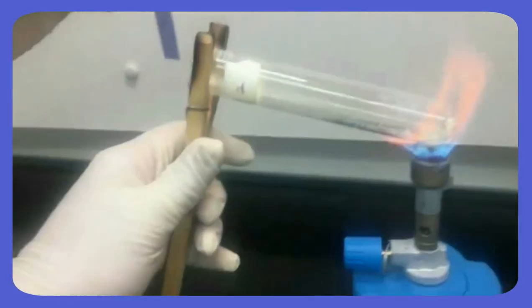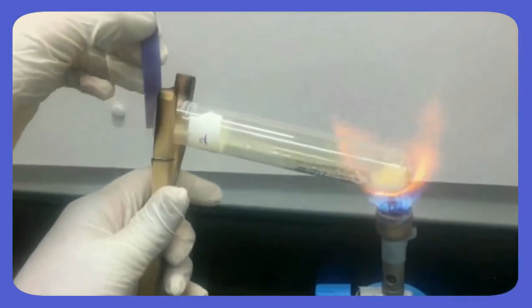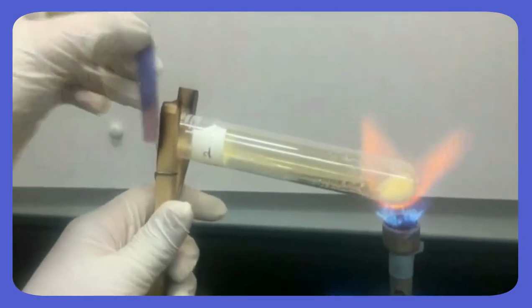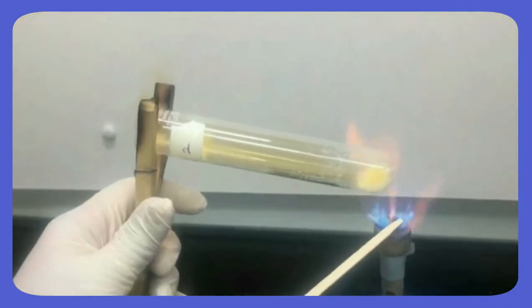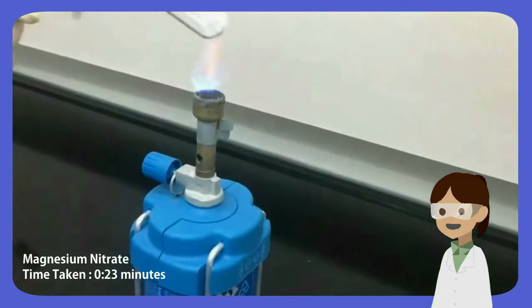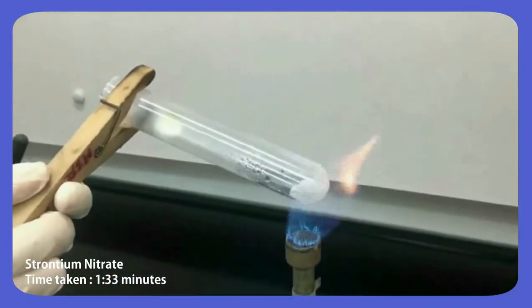Next, this moist red and blue litmus paper will be placed near the mouth of the test tube to check if the compound formed is in acidic or basic condition. Then, we will use a glowing wooden splinter to test the presence of oxygen. We then repeat the experiment using magnesium nitrate and strontium nitrate.